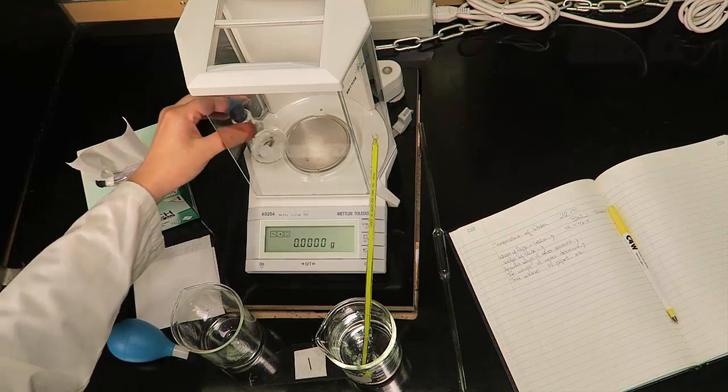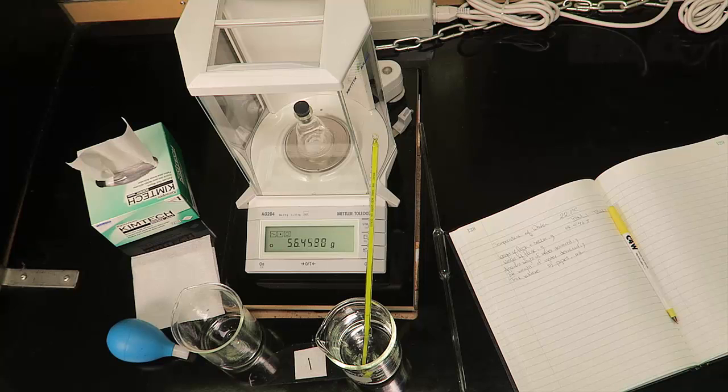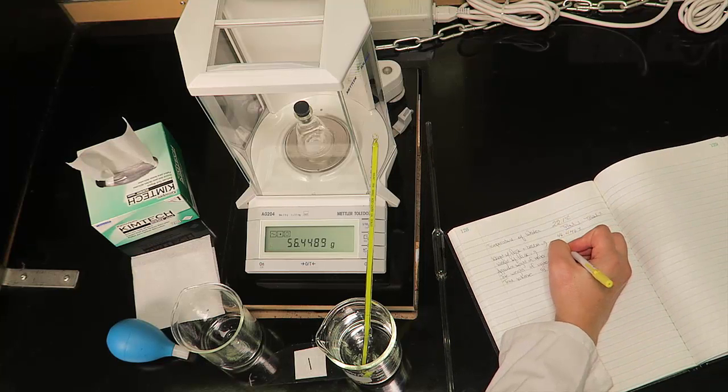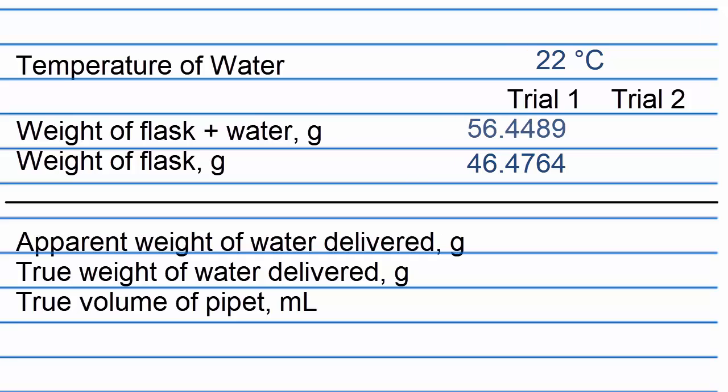Zero the balance. Place the conical flask and stopper containing the aliquot on the balance pan and close the balance doors. Record the weight into your laboratory notebook. The weight of flask for trial 2 is the same as the final weight of flask and water from trial 1.